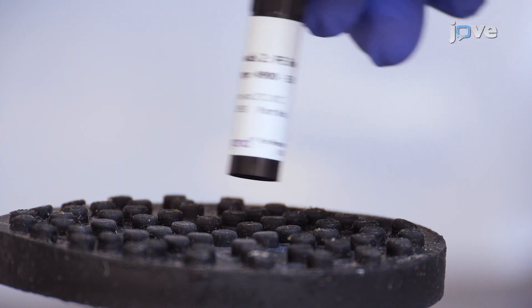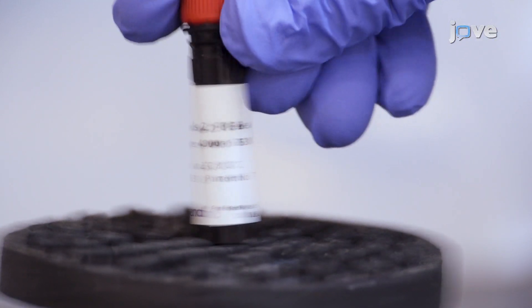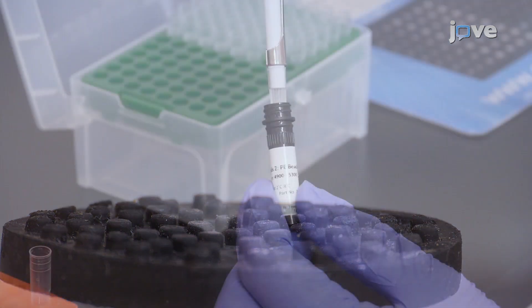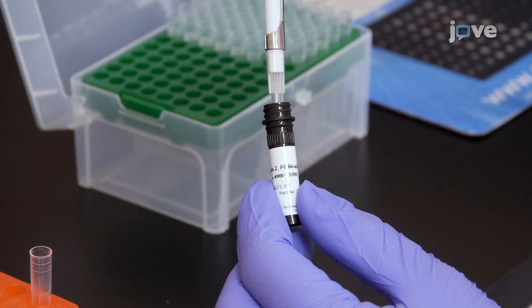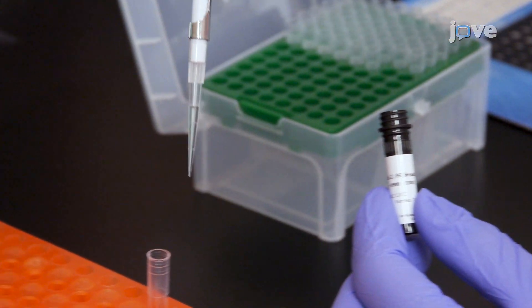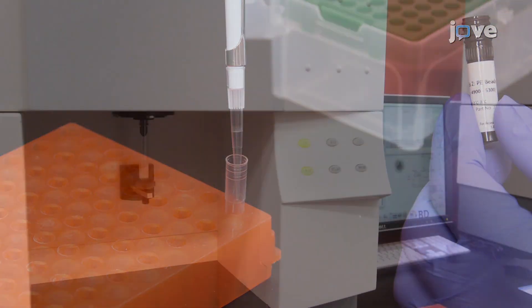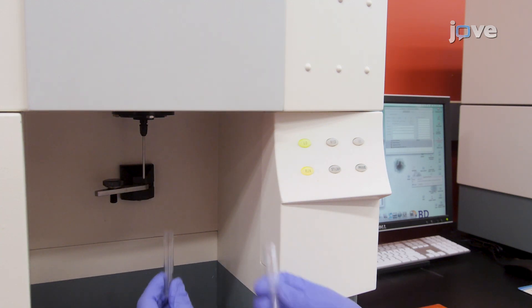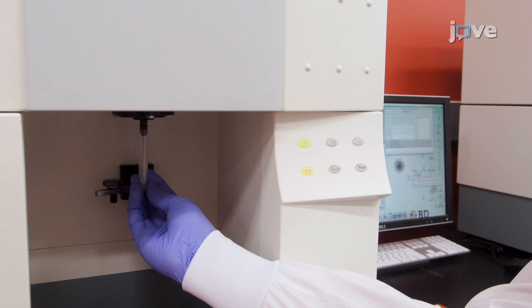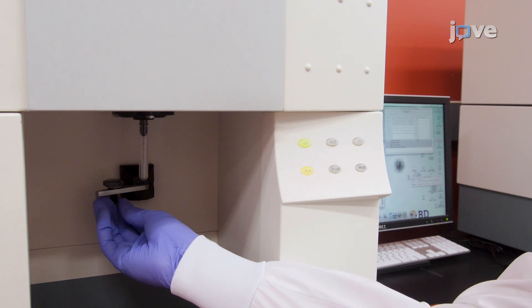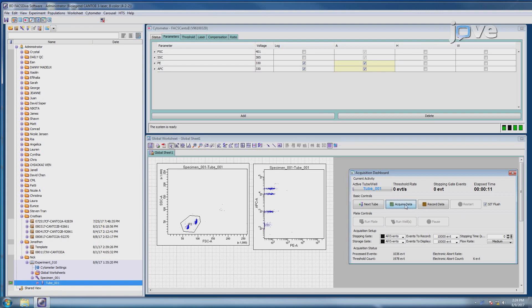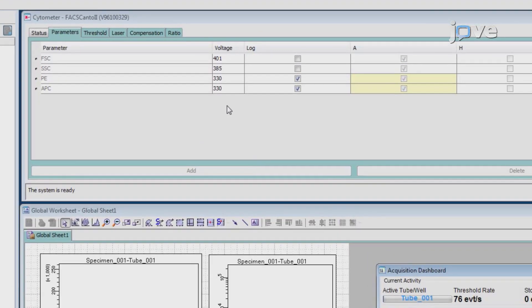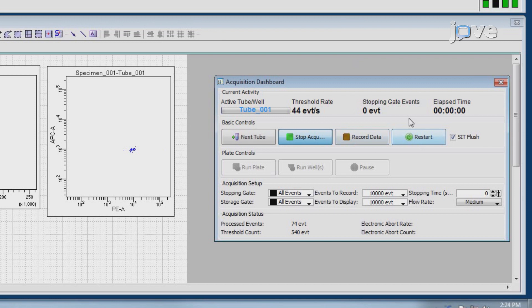Next, vortex the vial of PE setup beads for 30 seconds to resuspend the beads. Transfer 400 microliters of the resuspended PE beads to a new FACS tube. Replace the raw beads tube in the flow cytometer with the PE beads tube. Adjust the photomultiplier tube voltage for the PE fluorescence channel setting so that the MFI of the PE beads falls between the lot-specific range found listed on the PE beads vial.